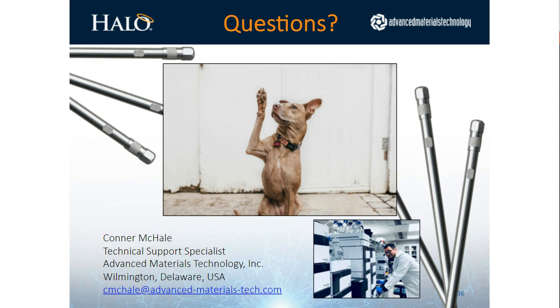Great, thank you for that advice. Have a sort of long question here. For those of us who have to backflush our columns during a run, does this increase the risk of void space in the column? They say that they've recently had to send a column out to get repacked, and they're wondering if backflushing contributed. Unfortunately, it's a necessity of their method.